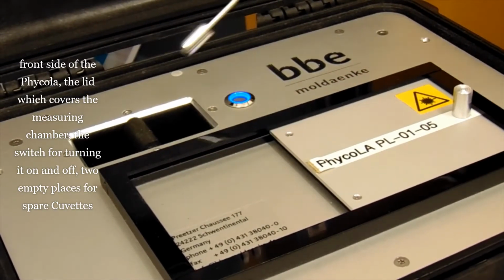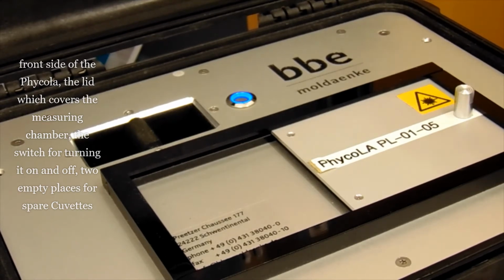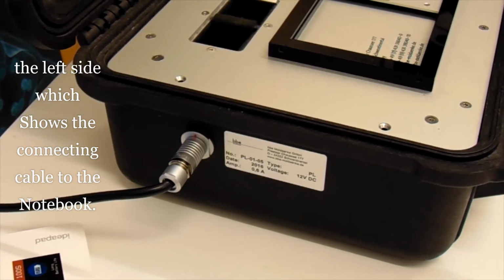Then you have here two places to store empty cuvettes when you are outside in the field, for example, and you want to use other cuvettes. On this side you see the output, which is the connection between the PC and the PhycoLabAnalyser.